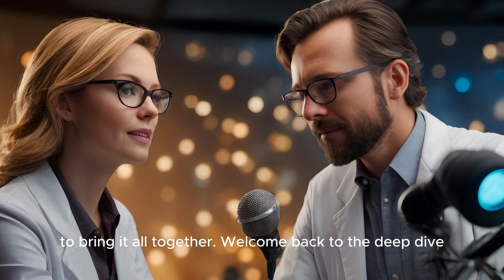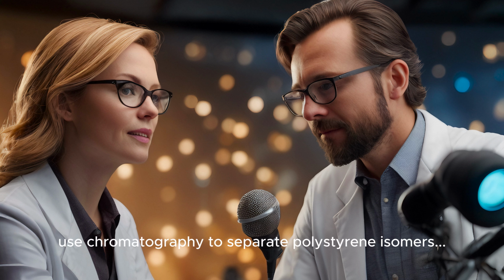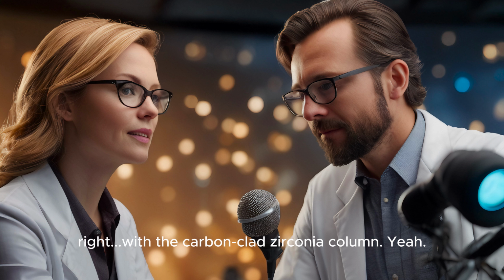Welcome back to the deep dive. So far, we've looked at how these tiny little differences in polymer structure can lead to huge changes in material properties. Yeah. And we've also seen how Sweeney, Wong, and Shalliker use chromatography to separate polystyrene isomers with the carbon-clad zirconia column, proving to be particularly effective. Yeah, it was great. Now let's dive deeper into the real-world applications of this research.